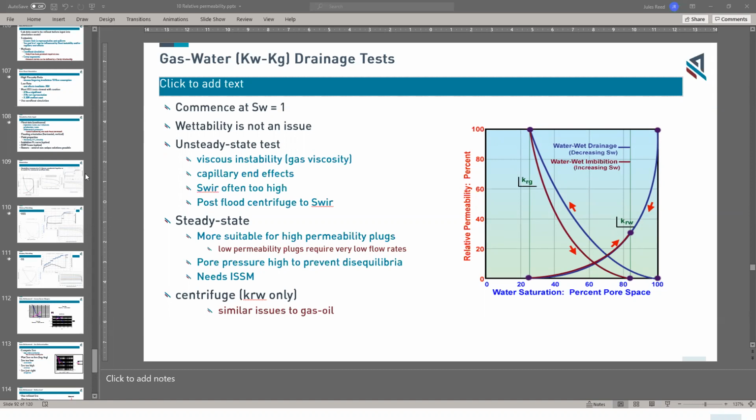And that can be done either under a fluid, or it can also be done in a core holder. So you can perform countercurrent testing in a core holder, but what you're basically doing is you're not flowing through the sample. You're just flowing across the surface of the sample, and imbibition is going to happen in one direction and production is happening in the opposite direction.